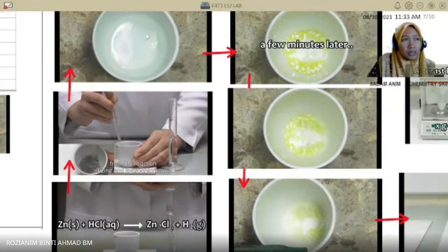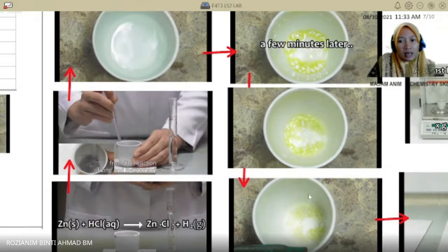No precipitate, no solid exist at this area, dan baru kita heating by using the hot plate. So during heating, bila dia nak reach to the end point, so bubble, okay, we release out. Kenapa? Sebabnya dia akan bebaskan hydrogen gas. Inilah target yang kita nak.